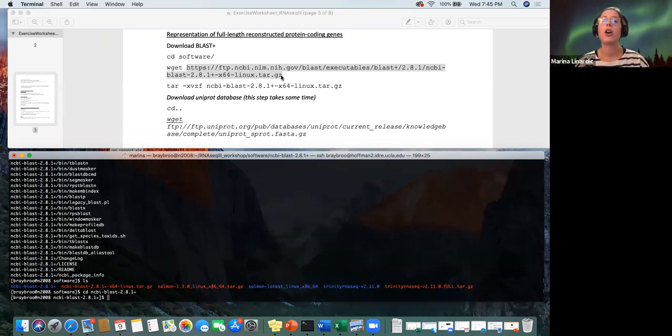Did you copy paste this website, Alex? Yeah. Sorry, it's Sheridan. Alex is helping out. Yeah, so there's going to be a space right here between this NCBI here and BLAST because it's in the second line. So just make sure you don't have any spaces.